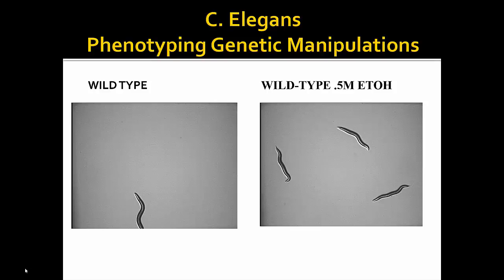So why do you see that? You can knock out a particular gene and see if you lose that phenotype in that animal, and then you can say, maybe this gene is what causes development of tolerance to alcohol, say. Then can you alter that gene? Can you make a drug that targets that gene? And that's just from this very simple locomotor behavior test.